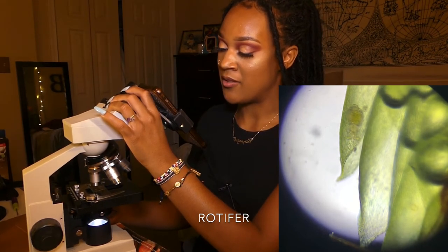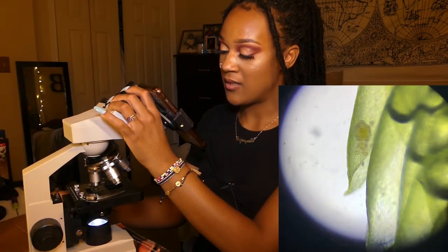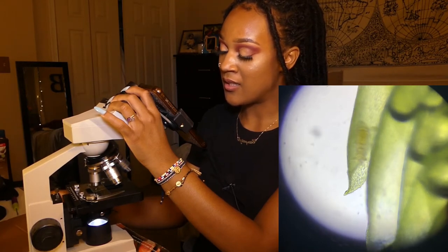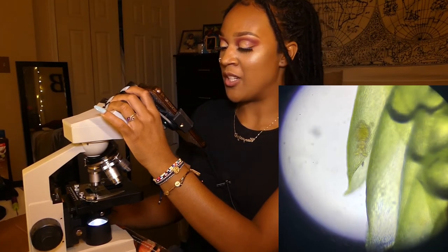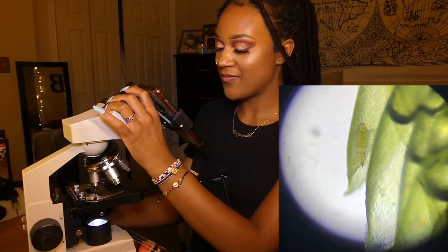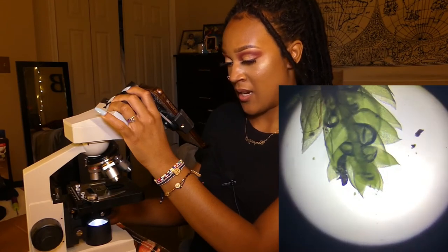Here, you see the opening? That's definitely a rotifer. It must be eating. So you see the opening? It's kind of like sucking in. So it kind of goes through. So you see like the thing moving inside of it. So look at it, it's like a filter feeder. You can see all the tiny particles being sucked in. So crazy.